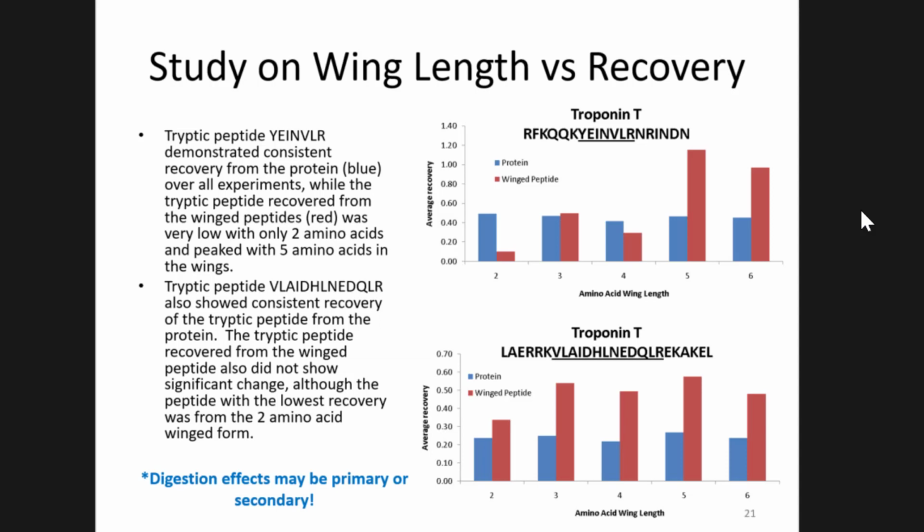It was not good to know that 3 different people got 3 completely different results. And it was good to know that a person could repeat with a protocol and get the same results. But this is why this never went anywhere, because we weren't sure how to interpret the data or what the causes were. There could be a couple of effects that were just tangled up.